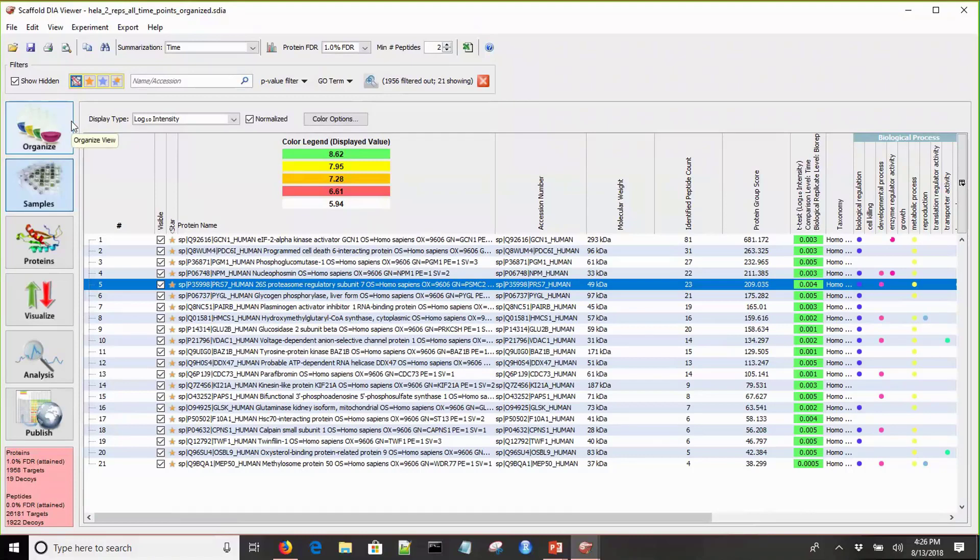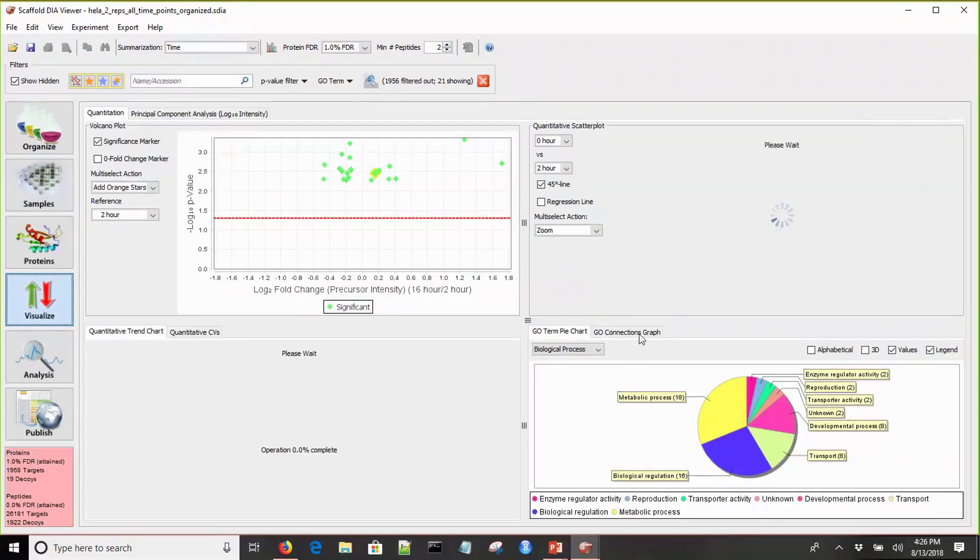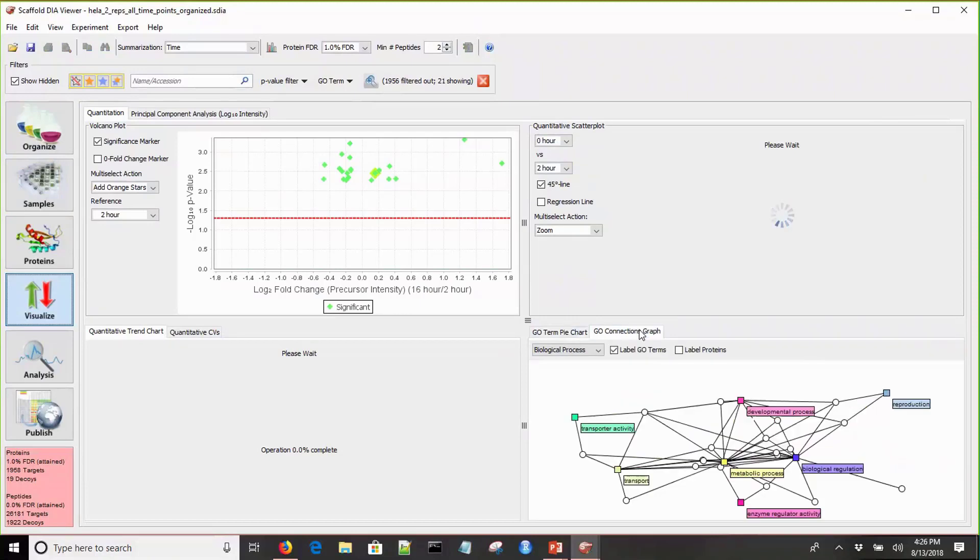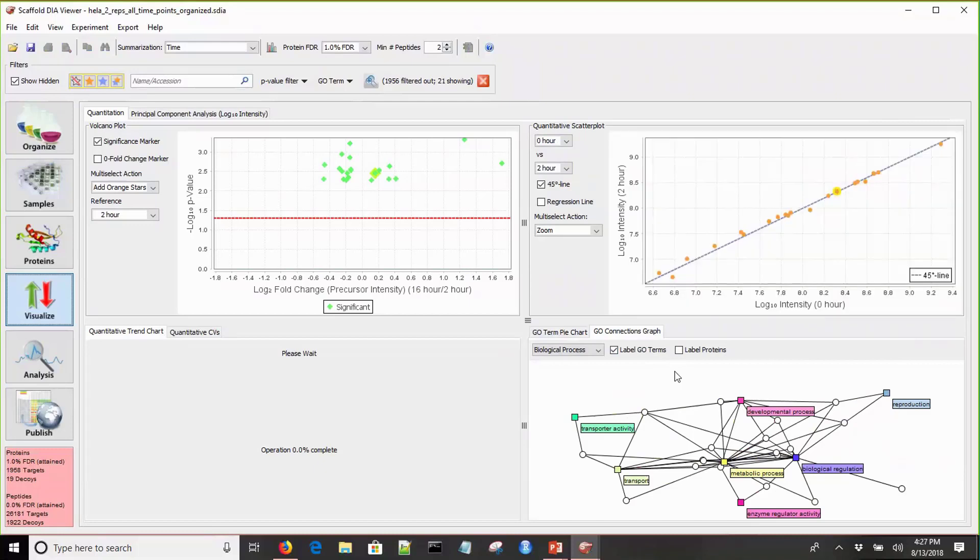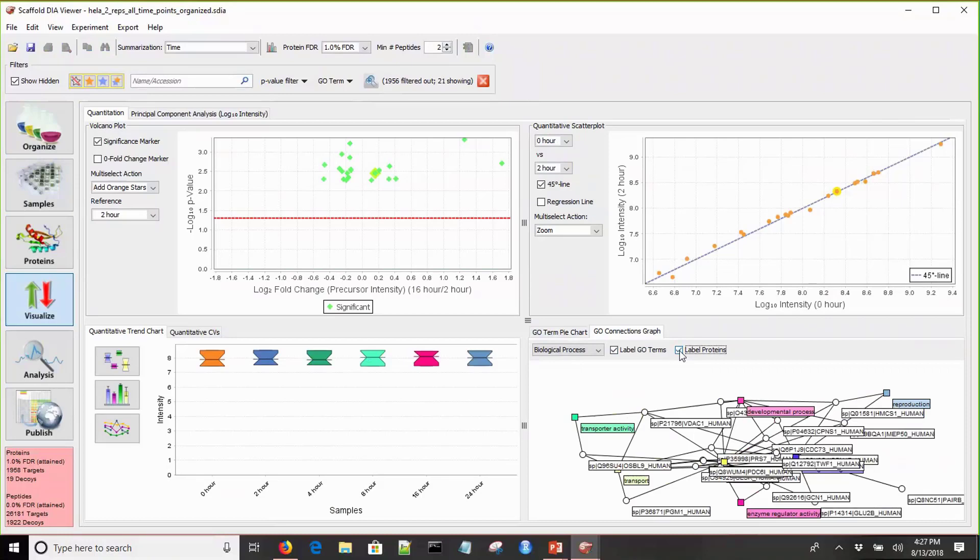Now that we have a small list of statistically significant proteins, let's go back to the visualize view and go to the GO Connections graph. Here we can see a list of just statistically significant proteins that we're interested in, and we can see how they cluster based on their GO terms. I can label these, and we can see all of the names for all of the proteins.